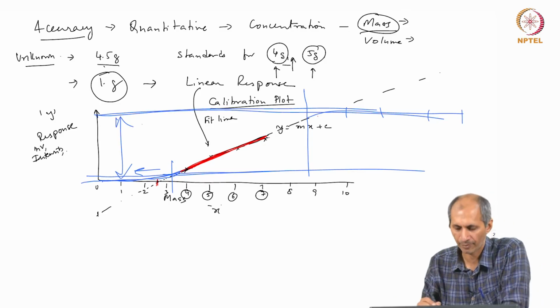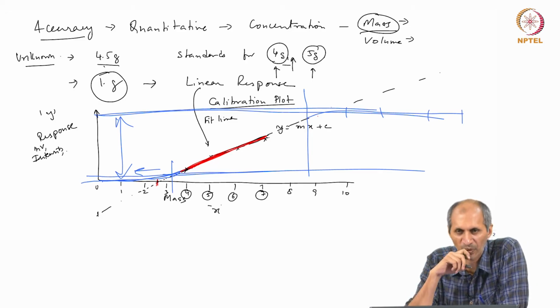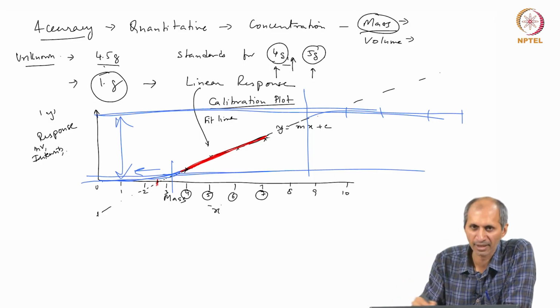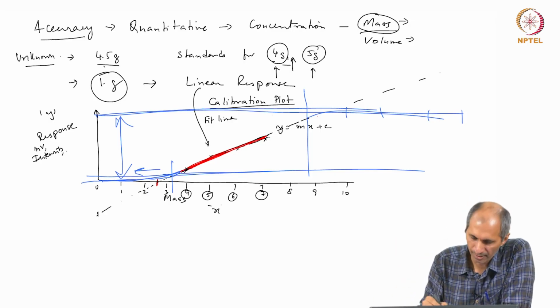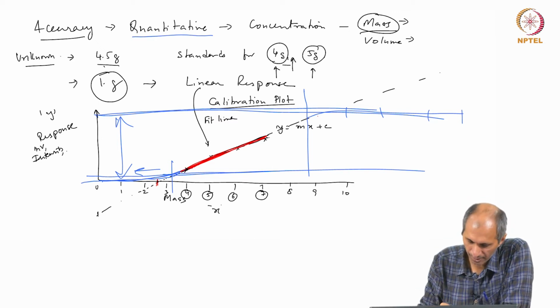between these two values. So, this calibration has to be done, you have to find out the range in which you have to plot this entire calibration curve to know the range in which I can find out what is the quantitative response of this instrument, which means I need to have standards that help me construct this calibration curve.